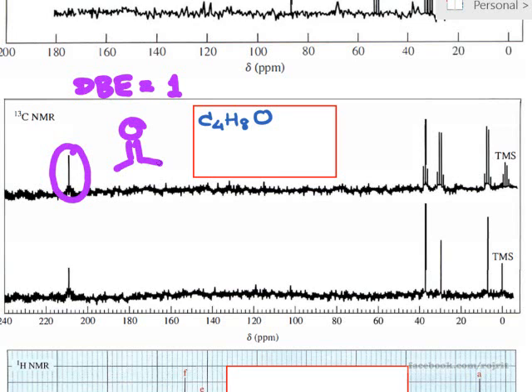Now, for the right hand side, we have two regions actually, about 20 to 40, about 30 something. Right? So if you divide it by 15 approximately, it ends with 2 ppm for proton NMR. 2 ppm for proton NMR is the proton connecting with the carbon next to the carbonyl group.